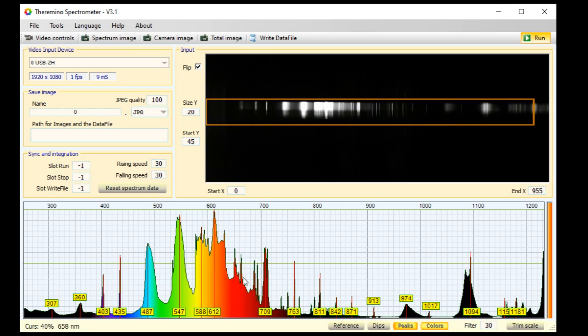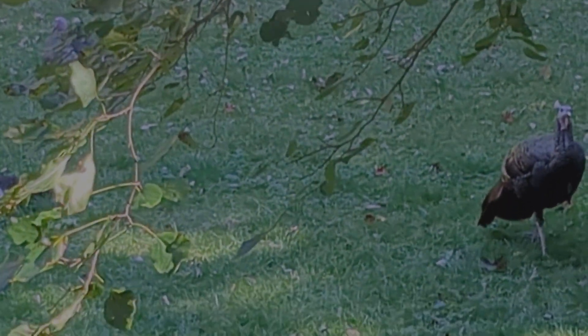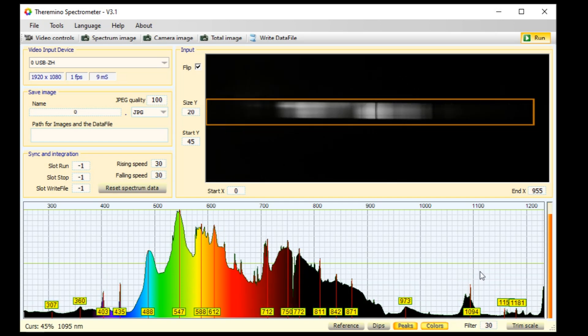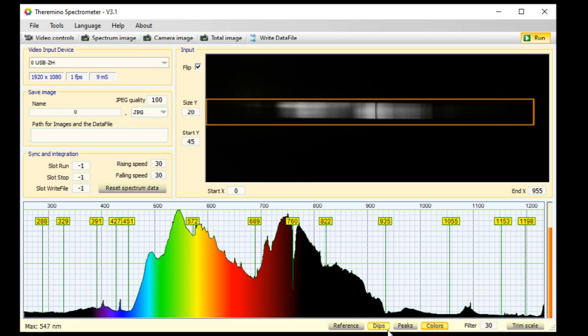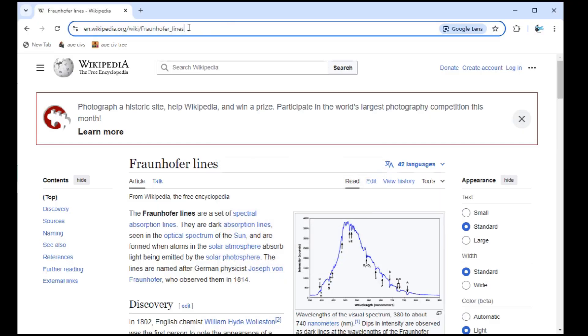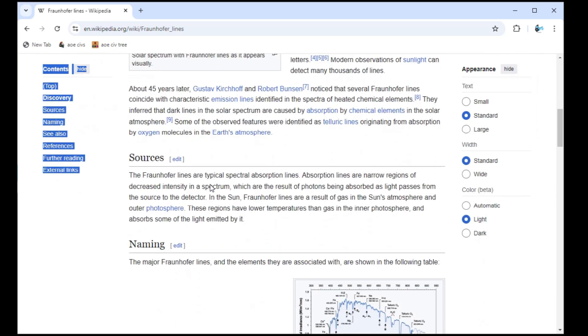Let's look at the sun now. Turn off that bulb and point the spectrometer at almost anything out the window — ideally something white, but a tree, a house, really anything. I'm going to uncheck peaks and check dips, as the sun has absorption lines. I'm looking for the hydrogen alpha line as it is almost on top of the same color as some lasers I want to calibrate. This page has a nice chart showing the sun absorption lines.